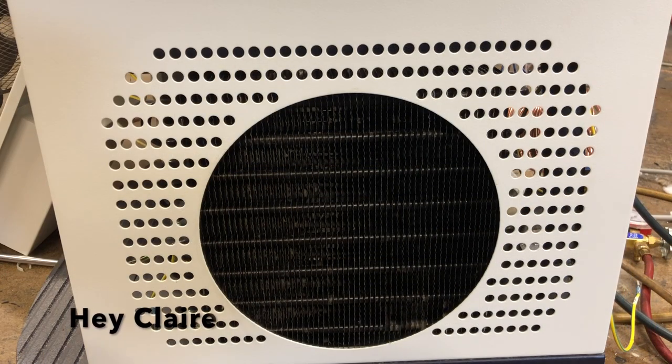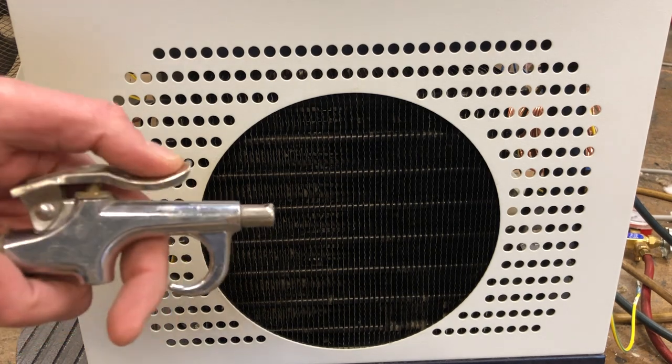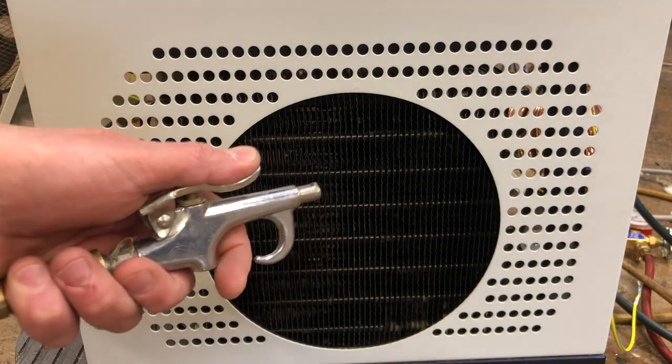At our shop in Franklin Park we have a big compressor like they would have in an auto shop, and we're able to use a nozzle to really get some air going through those coils and clean them out very well.